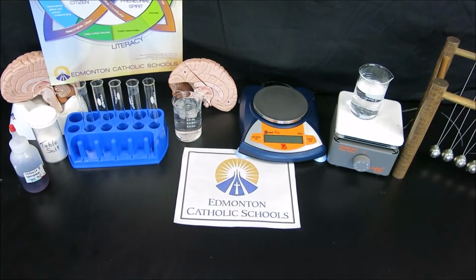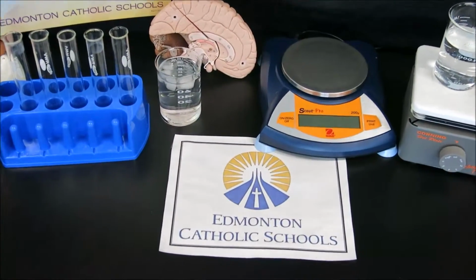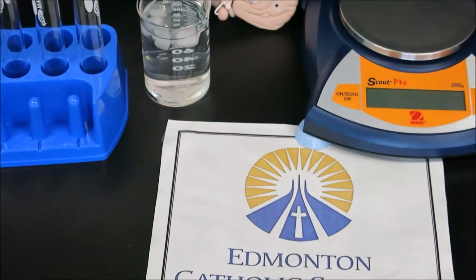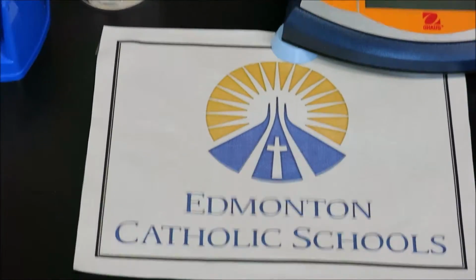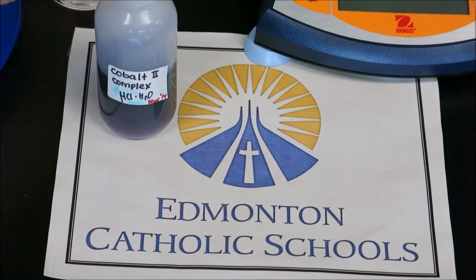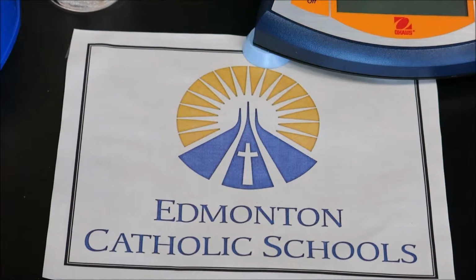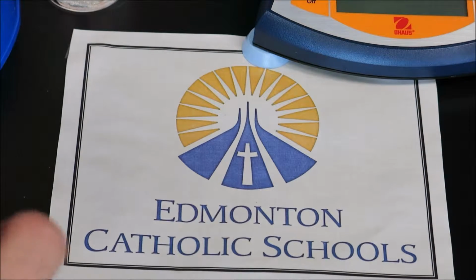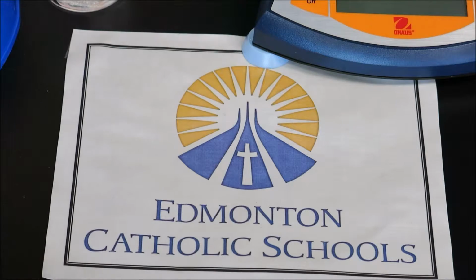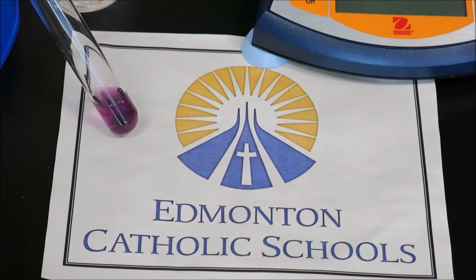Keeping in mind that this lab is based out of your module, take a look at the equilibrium equation for the cobalt chloride complex, including water and chloride ions. And what we'll do today is demonstrate the stresses and the shifts to the equilibrium. In order to do that, we're going to use our cobalt complex here, which is an equilibrium system. Because if we take a look at the reaction, we'll see that the reactants and the products are different colors. We have pink and blue, and when put together, the equilibrium is a purple color.